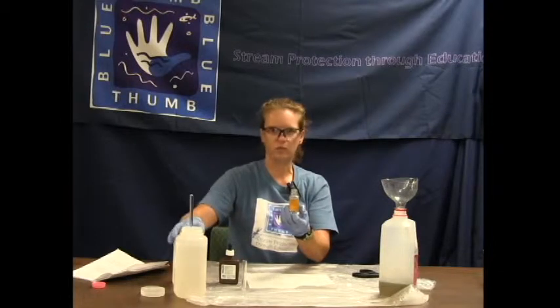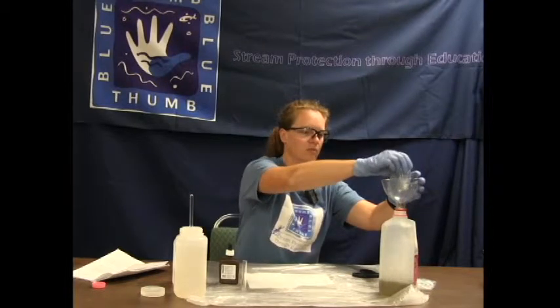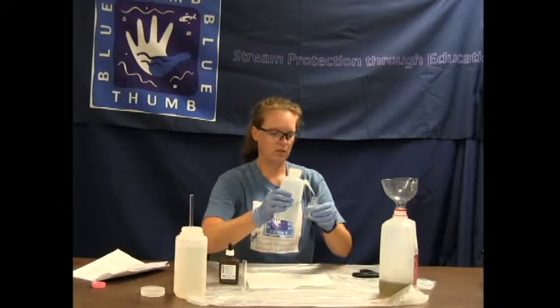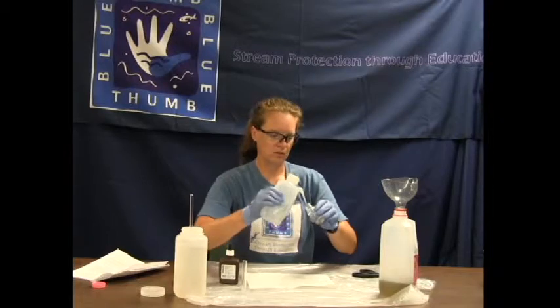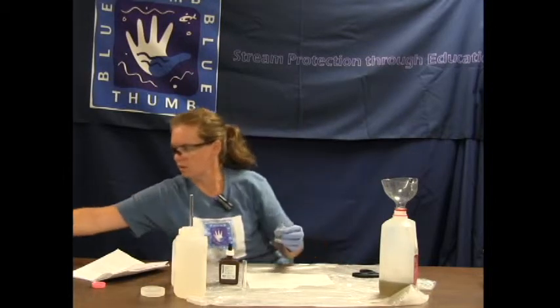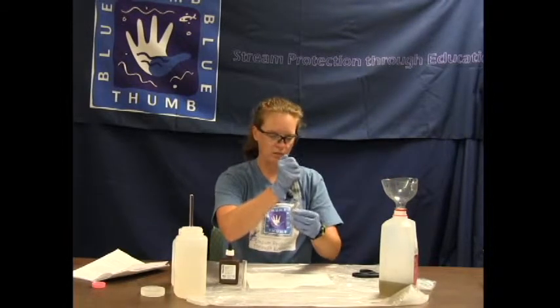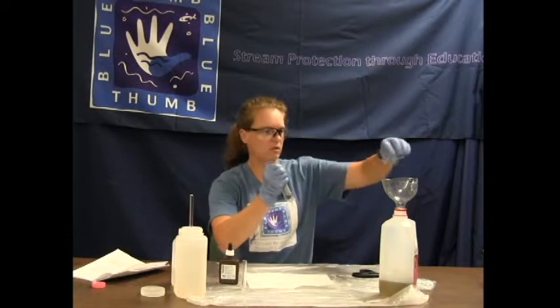Our blank is working, our deionized water is working, our reagents are working fine — the equipment and us as scientists. Our blank is good. Now we need to run our creek water test. First, rinse three times with deionized water to get that previous test rinsed out. Then rinse with creek water three times to rinse out any deionized water still in the bottle and coat the inside with the water we are going to be testing — that is good lab practice.